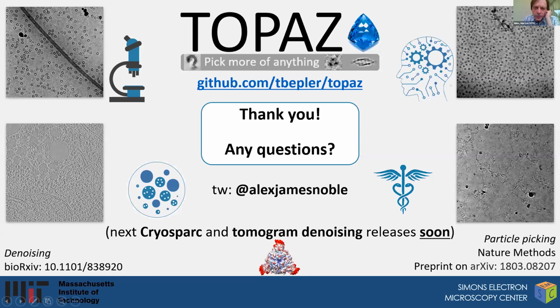So there were a couple of questions about ice gradients. I've lost who said that, but basically how does the ice gradient affect particle picking and the denoising? So as you might expect in denoising, when you have a thicker ice gradient, then it becomes more opaque even after denoising. I don't believe there's a gradient subtraction in the denoising function.